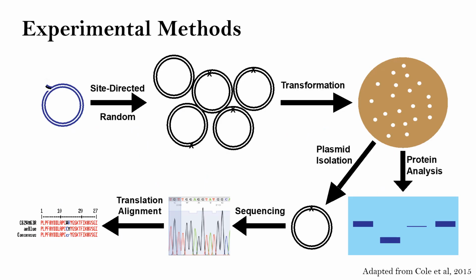With a view to observing a change in its color expression, we had two approaches: site-directed mutagenesis and random mutagenesis. For site-directed, we used the designed primers that I mentioned in the last slide, and for random mutations, we used sloppy PCR. We then transformed those into bacteria. We isolated the DNA and sent them for sequencing. We also visualized the proteins using the SDS-PAGE.